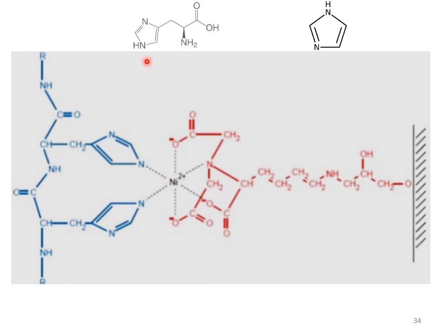Now, when proteins are added and the proteins contain a histidine tag on them, then the histidine tag proteins are going to bind to the stationary phase by means of this nickel ion coordination complex. The stationary phase groups are shown in red color here, and these blue groups are representing the histidine tag which is attached to the protein.